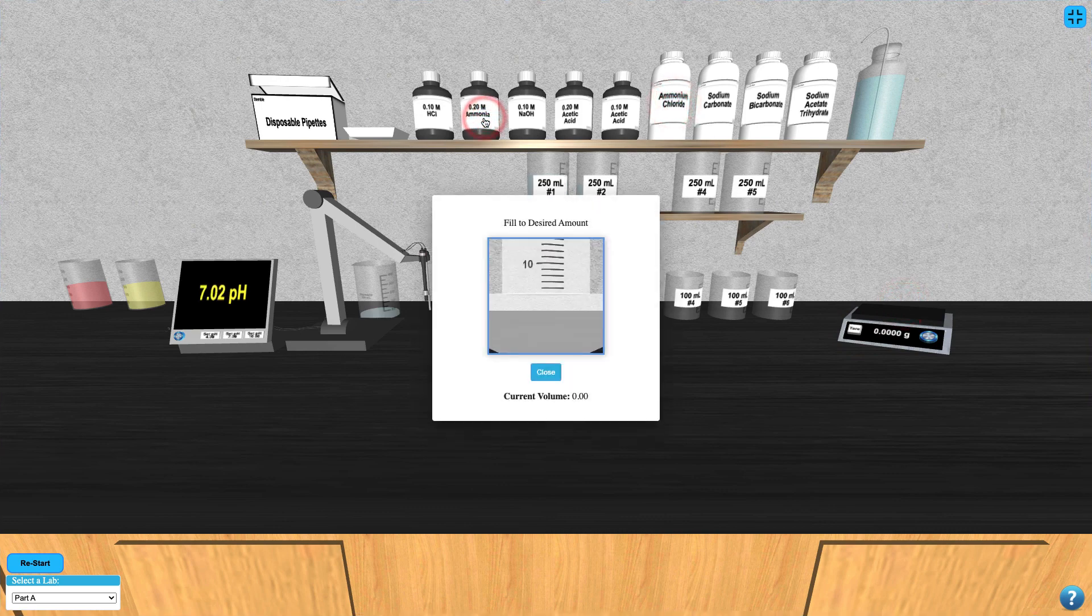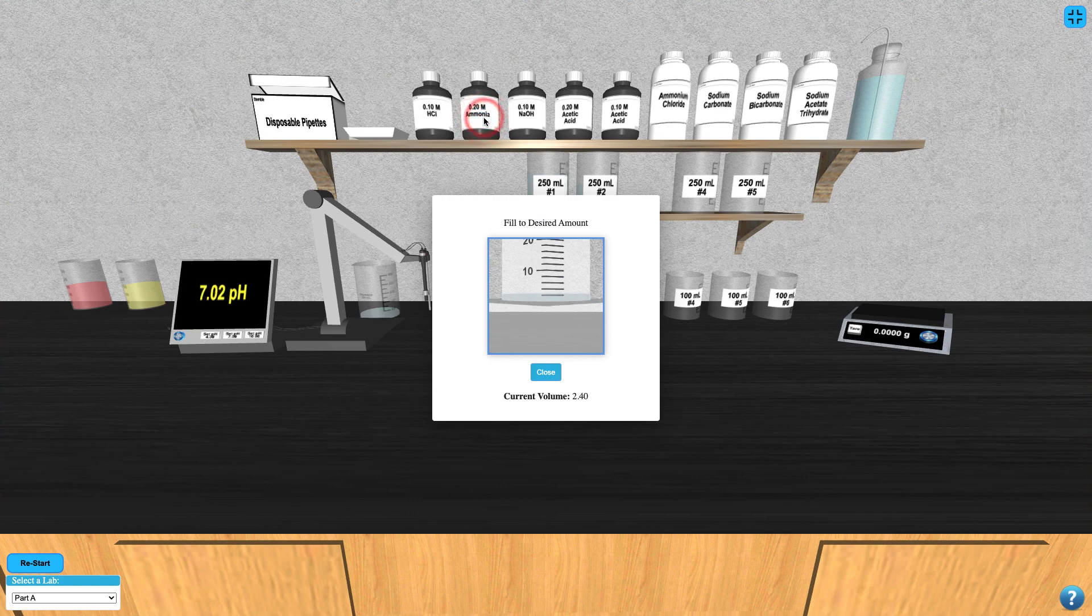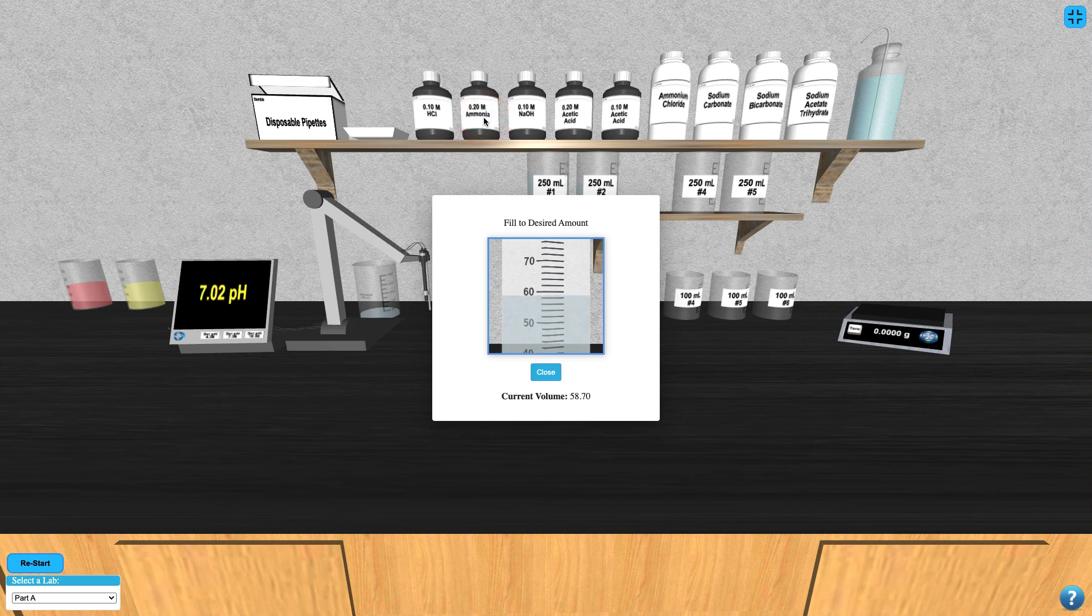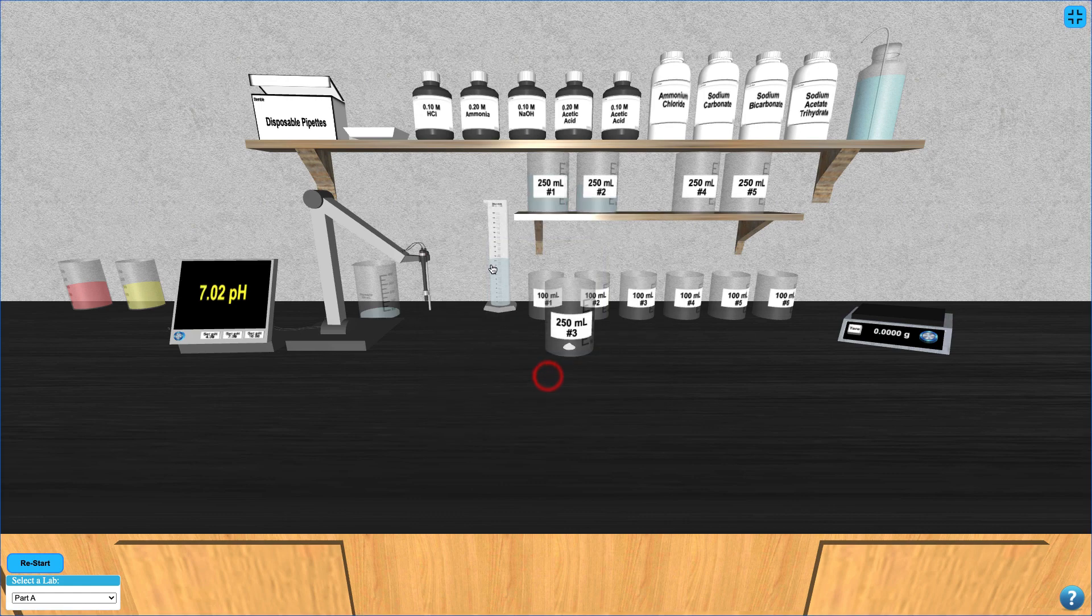To add any of the stock solutions on the shelf to your beaker, simply click on them and use your up arrow to fill a graduated cylinder to the desired amount.